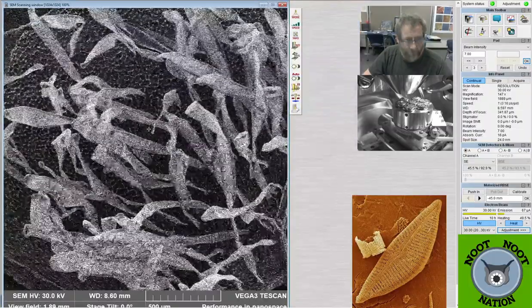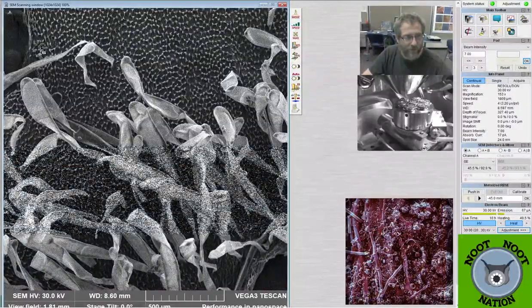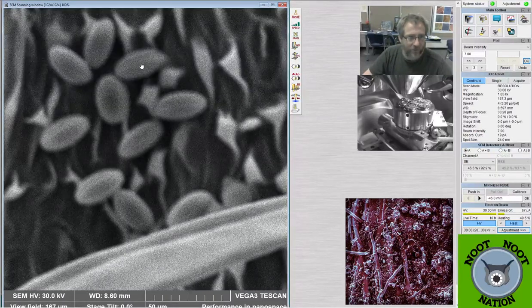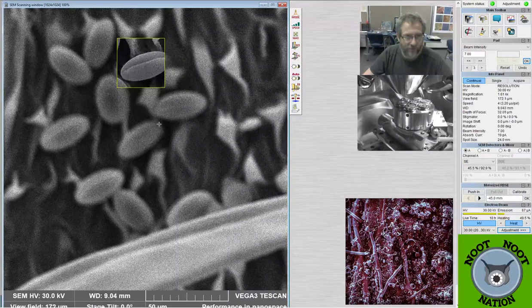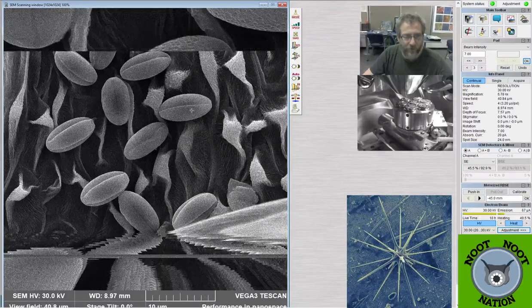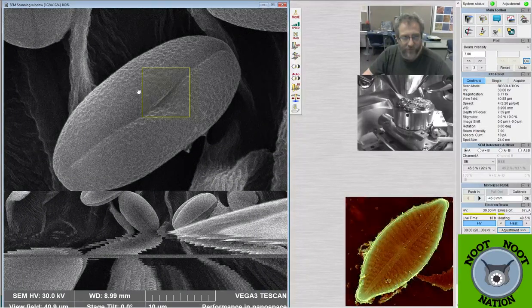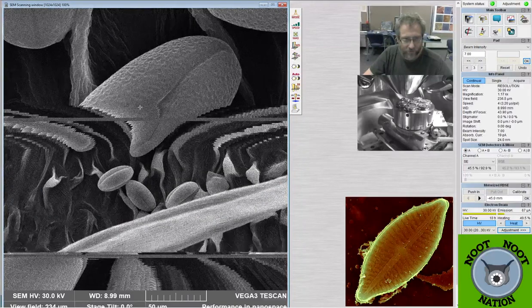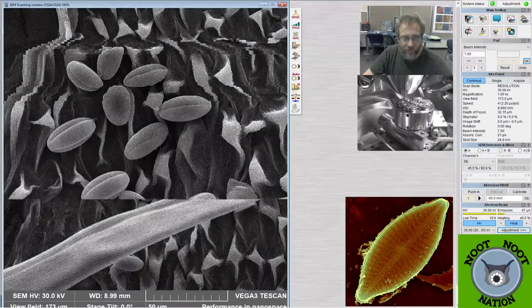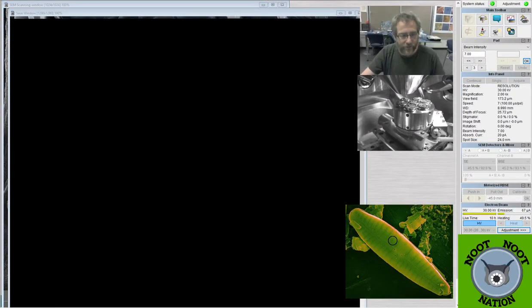Okay. So I'm going to put us on some pollen here that I hope is violet pollen, but maybe it's transferred from something else, from over here. Give me a second to get that in focus. I'm going to zoom in just to make sure I have really good focus. And then I will set it to collect another image. Good. 7.7, ready to go.